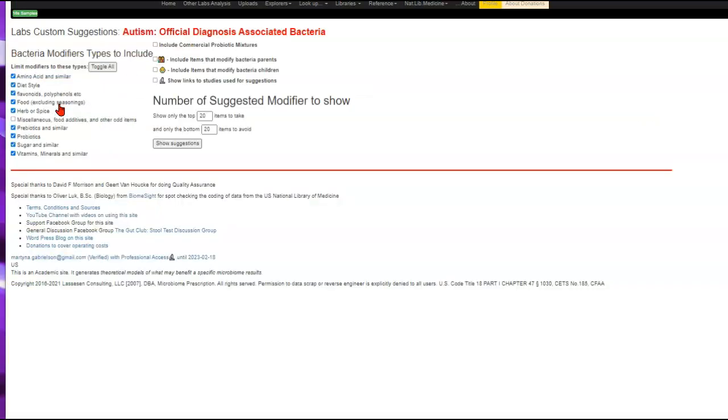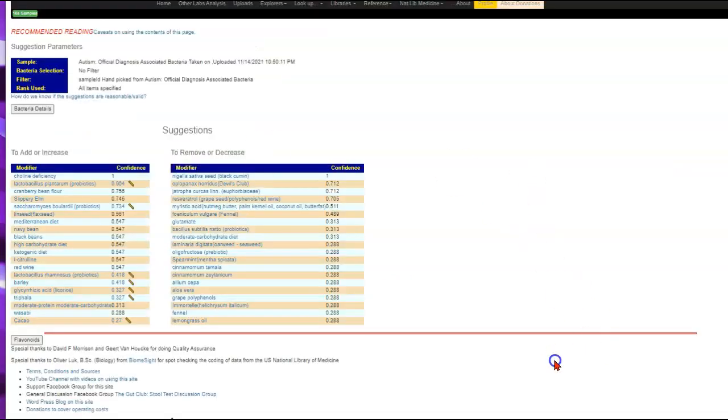And so now we go through here, and we can go through and get suggestions there. One or two of the items are recognized from our list, so we end up with actually 3 lists. Now we can go over to the consensus report.